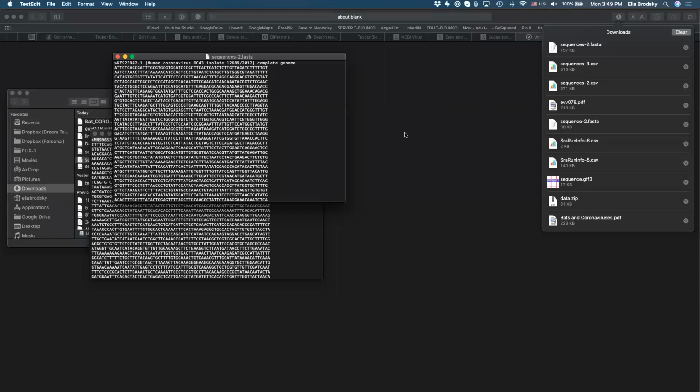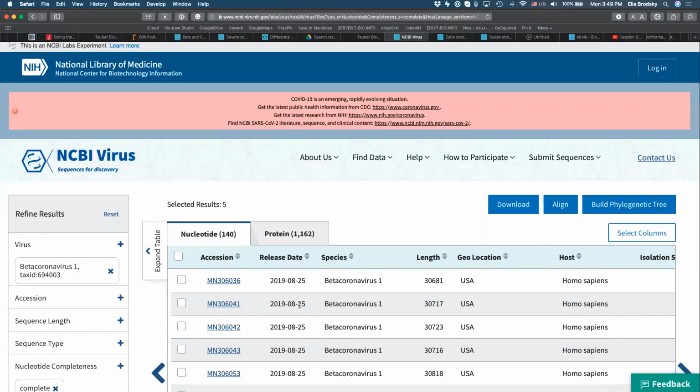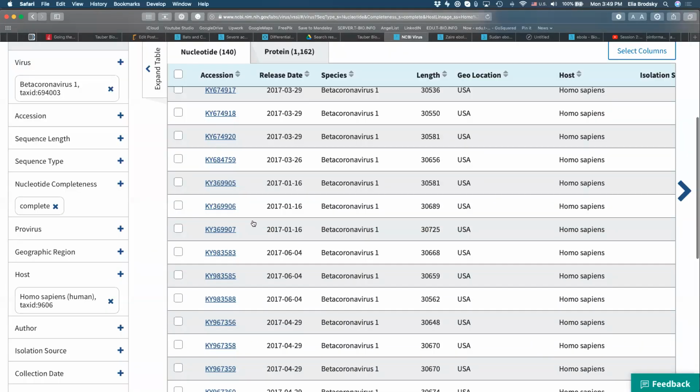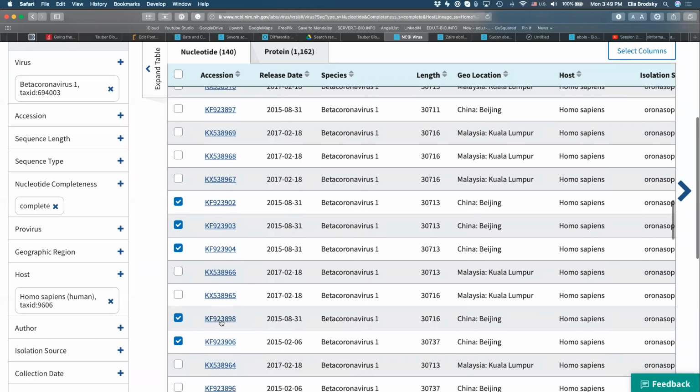Okay, so what are the 5? The 5 that I selected were from China. So you can see from 2015. So KF9, 23902, 23903, 23904, 23898, and 23906.